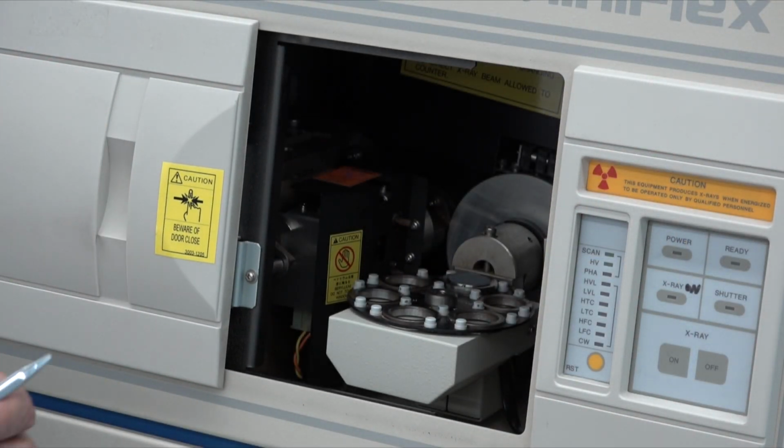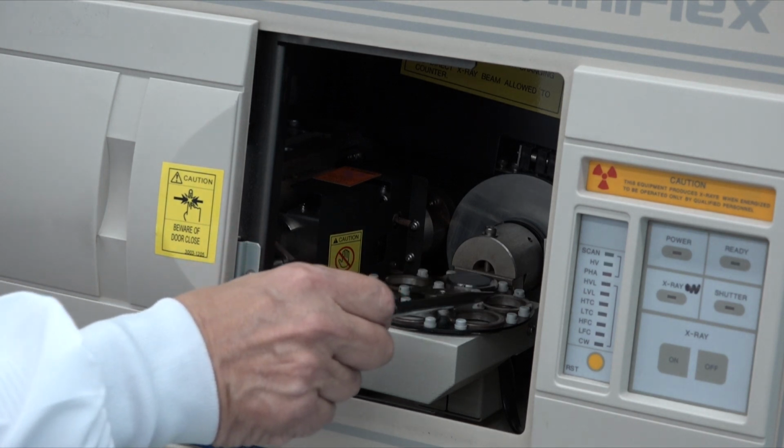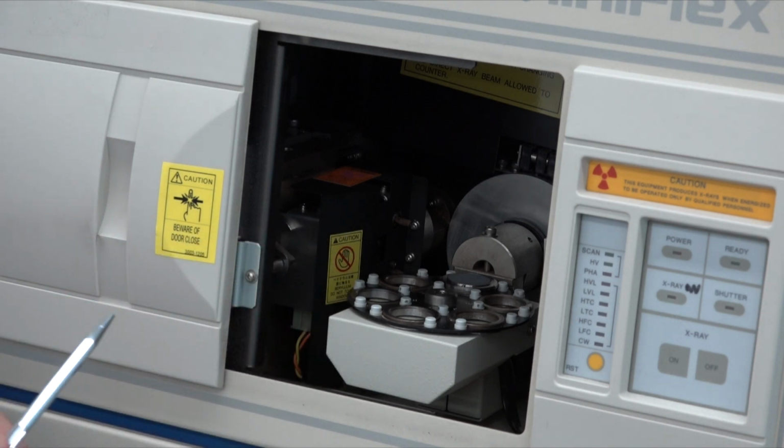Okay, inside here is one sample. You see that we have a multiple sample changer here that allows us to load up to 6 samples.